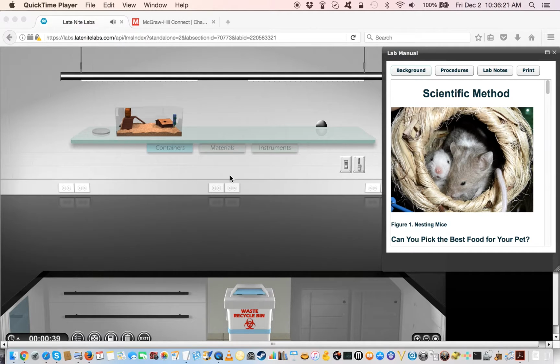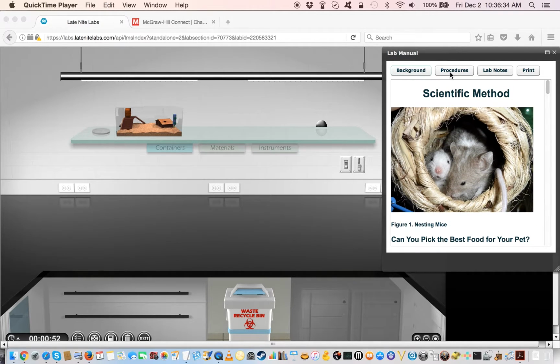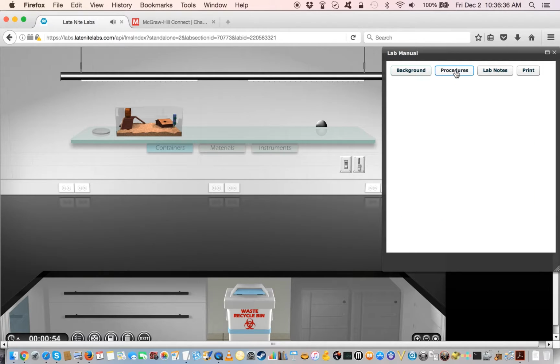Give you an idea of how to handle a scientific method lab. Well, the first thing you should do when you get into the lab is read the background. Now, it's actually pretty useful. I think you'll understand most of it, and it will give you a good idea of why you're doing what you're doing. So looking at the procedure, here's what you're going to do.